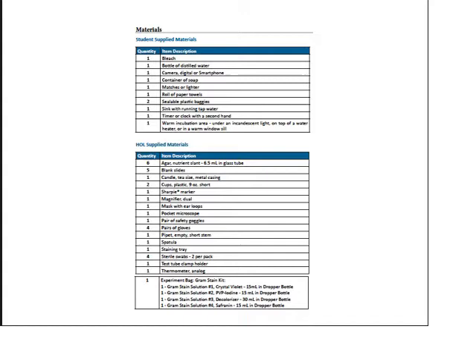From your gram staining bag: gram stain solution number one is crystal violet contained in a dropper bottle; gram stain solution number two is PVP iodine also in a dropper bottle; gram stain solution number three is the decolorizer also in a dropper bottle; and gram stain solution number four is safranin, also in a dropper bottle. Each solution is relatively small volume — 15 mL for solutions one, two, and four, and 30 mL for solution three.